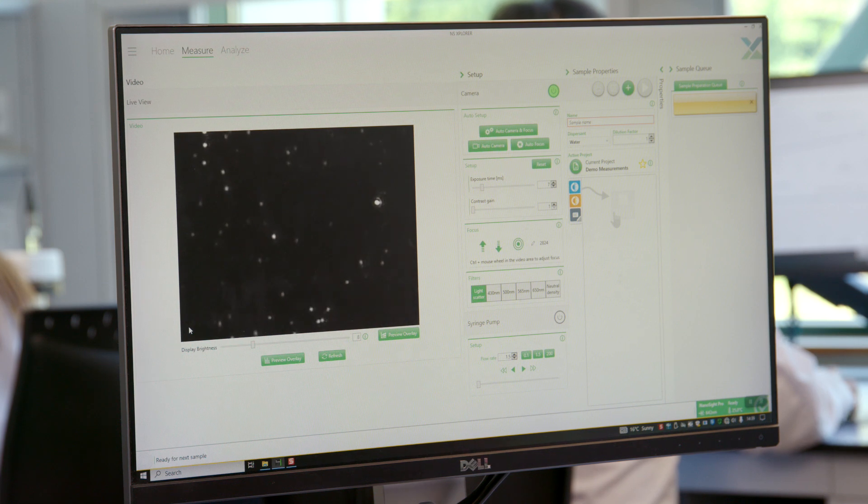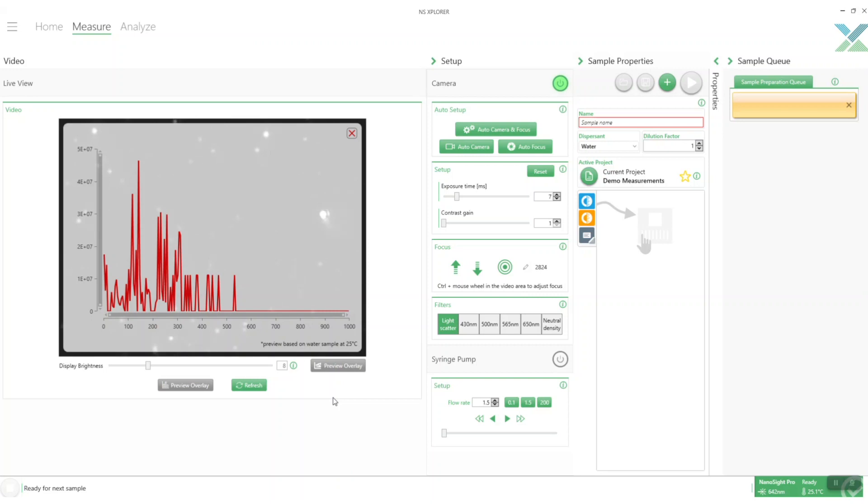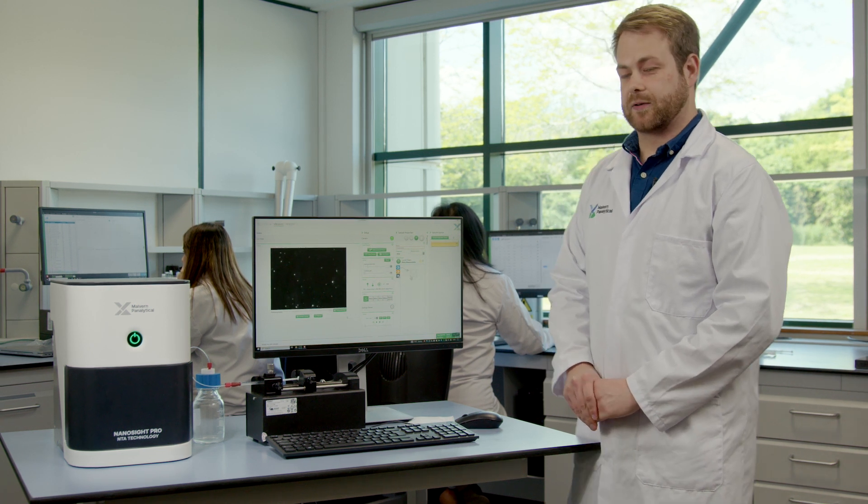To get a quick idea of how the size might be for your sample you can click on the preview overlay. This gives you a very quick graph to get an idea of what the size population might be and once you're happy with that you can look at setting up your measurement normally.